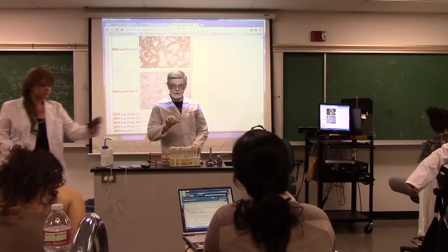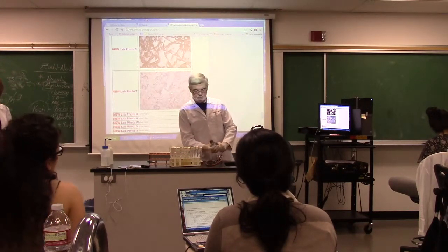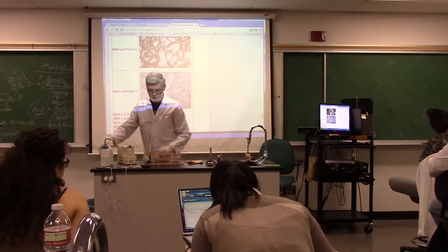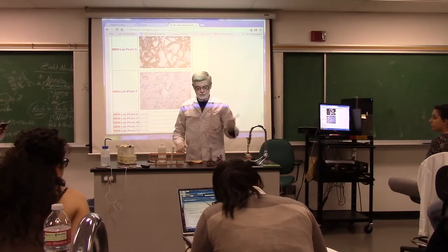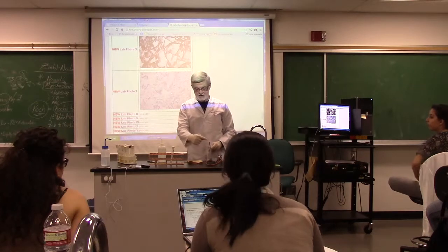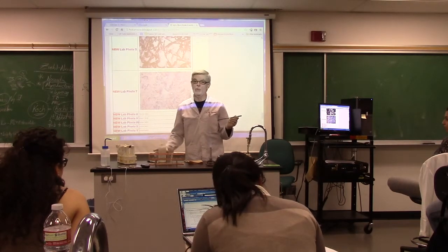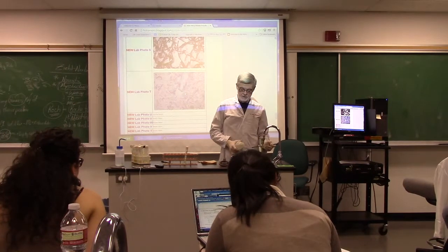So I have my little clean slide here, and I'm going to make my smear. At first, I was going to make my smear before I even started, and then I thought, oh my gosh, you won't even see how hard it is to get the smear, because this thing is full of lumps. Remember, I had a lot of problem with people doing this. This leaves this contaminated, and that's contaminated. So you want to keep the whole length here every time, because if you carry the bacteria from one tube to the other, then everybody's going to have a mixed culture, and that'll make it very hard to read.